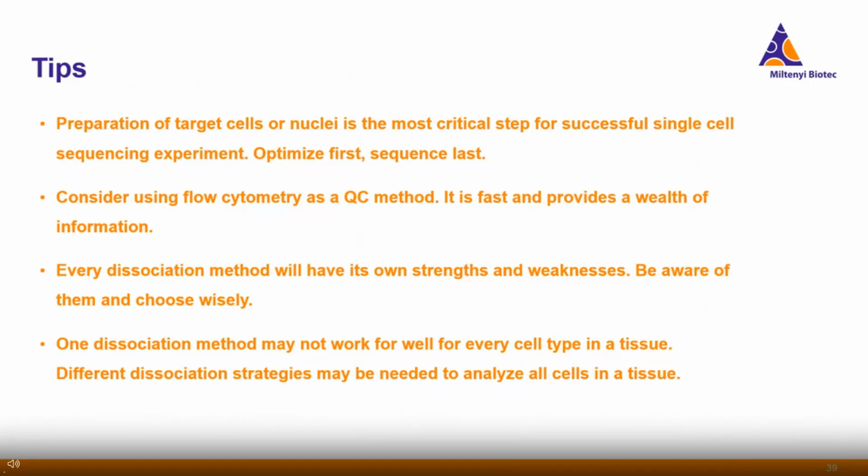So I came up with some general rules, tips, and practical advice for if you are just getting into single cell or single nucleus sequencing and are starting to develop your own sample prep methods. Preparation of target cells or nuclei is really the most critical step for a successful single cell sequencing experiment. Those experiments are expensive, so optimize your sample prep methods first, and that will save you time and money in sequencing in the end. And of course, if you can practice, definitely practice.